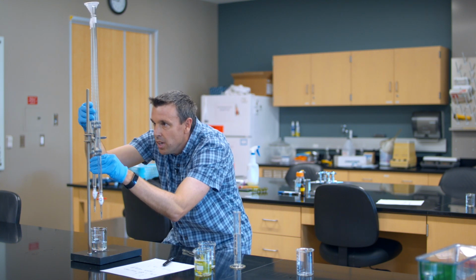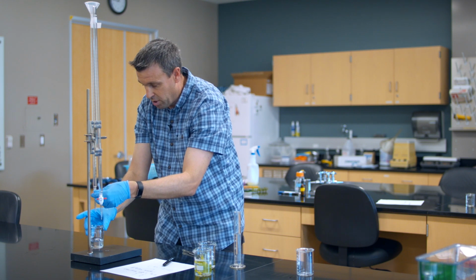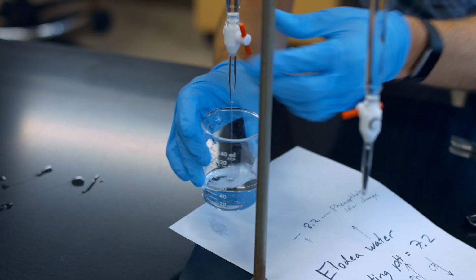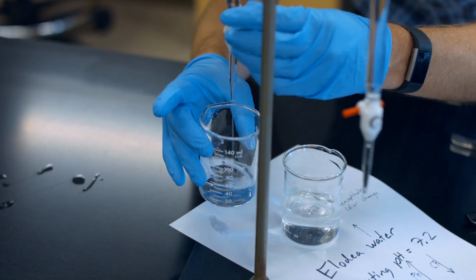And then we're going to use our standard titration method. Taking a look at this ahead of time, this is at 32.5 mils currently. And then I am going to titrate. All right, so as we're titrating, get my control beaker in here again.